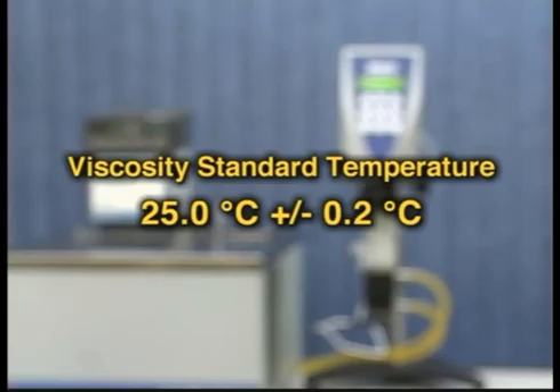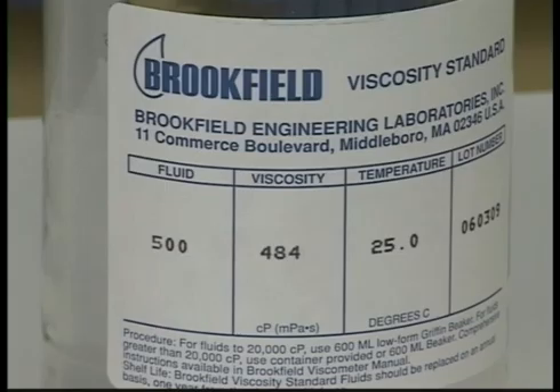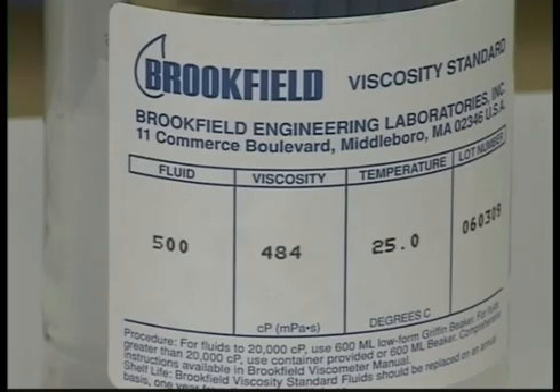The temperature of the viscosity standard should be controlled at 25.0 degrees centigrade, plus or minus 0.2 degrees centigrade. The thicker the fluid, the longer it will take to equilibrate. For this 500 centipoise fluid, approximately one hour should suffice.